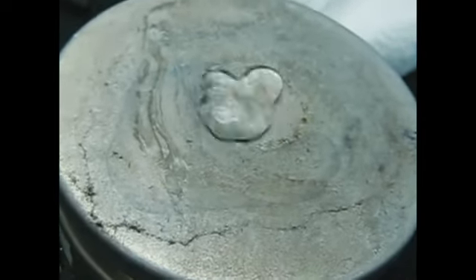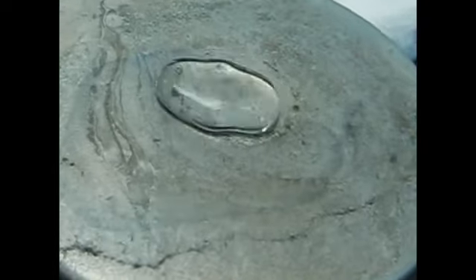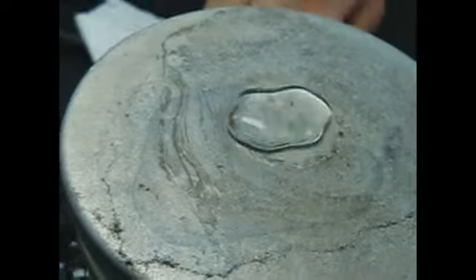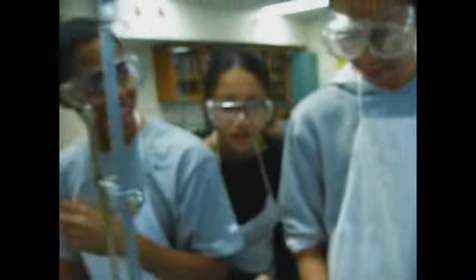All right, let's just see. Is it bubbling? What is it doing? Should I stop now? Oh, it's a good thing it just exploded. Wait, what is it doing? Well, what do you tell me? Hydrogen bonds. That's why the water is staying on. Surface tension. Oh, yes. Make sure that it gets on the video. Hydrogen bonds.